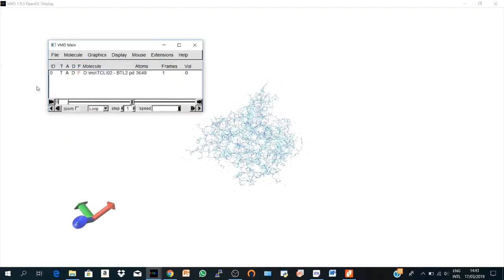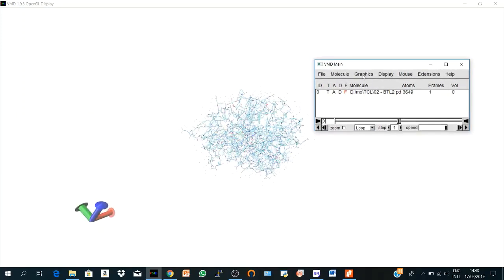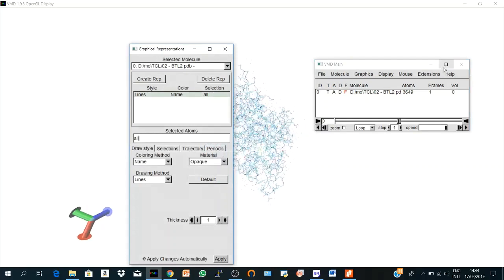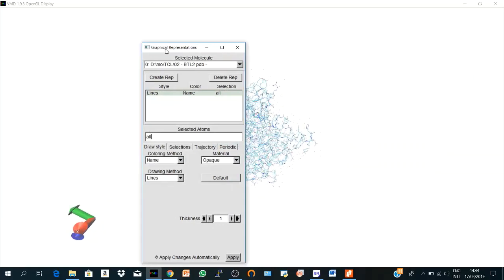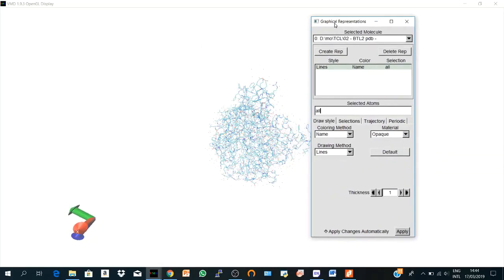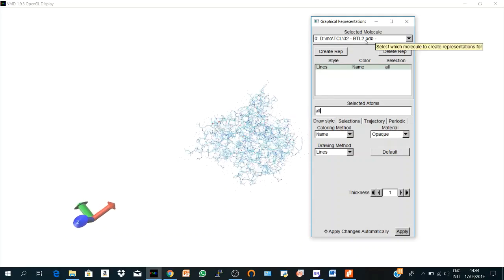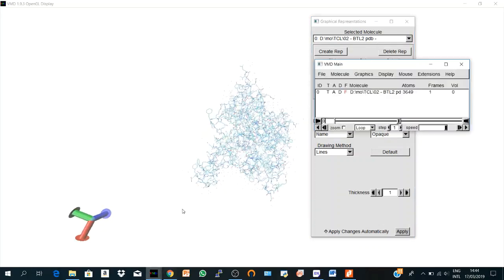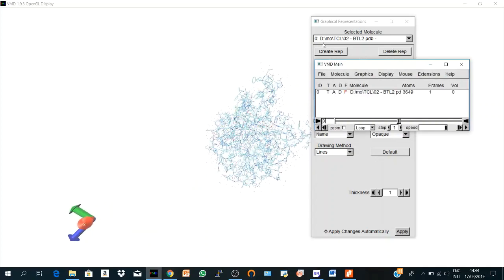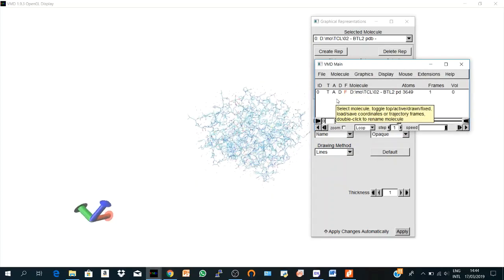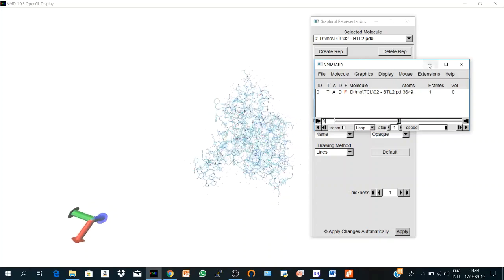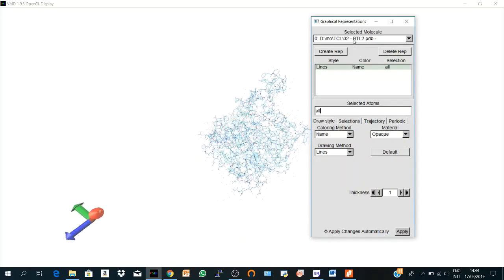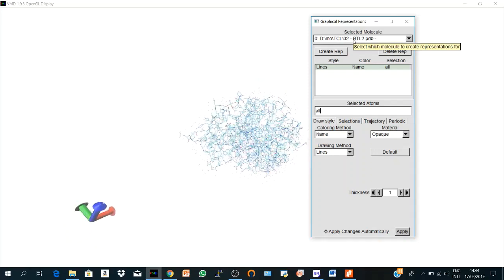Then let's go to our graphical representations window. We go to Graphics, Representations, and here is our main window. It contains some sections. The first section here is the selected molecule. Since we have here only one molecule, by default we're going to have it here. But if you load so many trajectories or different structures, you should choose from here, but it's already chosen by default.